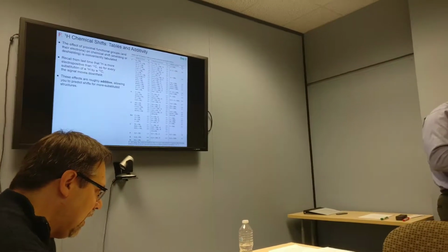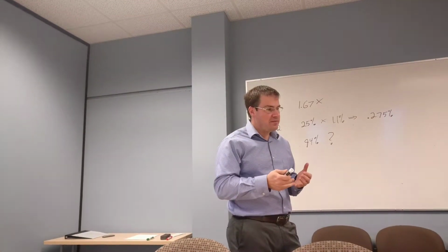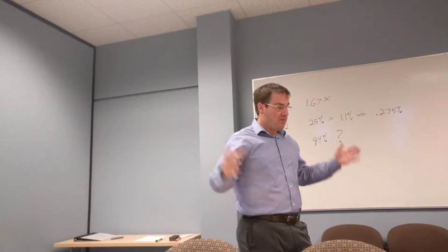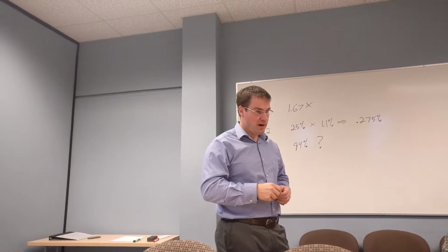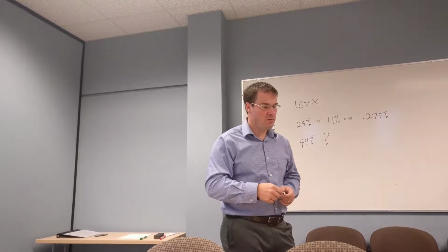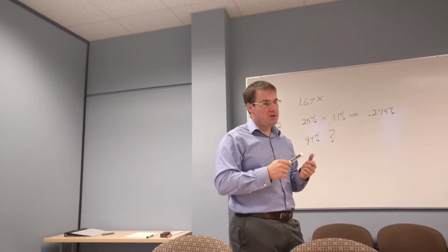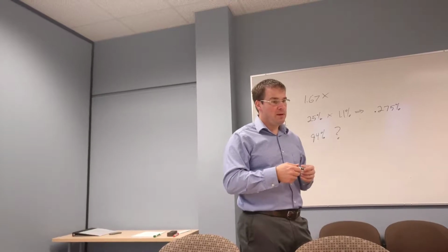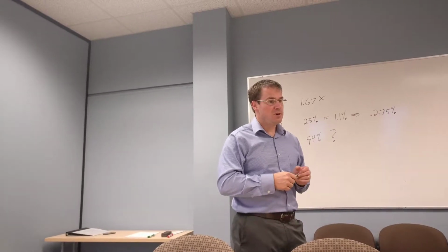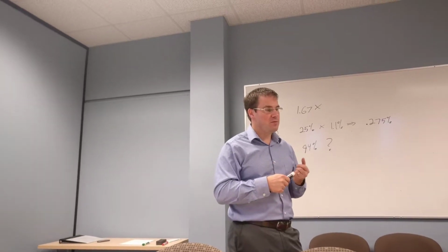One of the takeaway messages from last class should have been that what we read out as chemical shift for any given proton or carbon is dependent on the amount of other functional groups around that proton or carbon, and the amount to which they shield or deshield that particular proton or carbon that we're observing. And that's where you get a difference in chemical shift. It turns out that difference in chemical shift for simple functional groups is relatively consistent across molecules, particularly in the proton NMR. And so it's something that you can look up a reasonable approximation of what your expected chemical shift would be from a table.